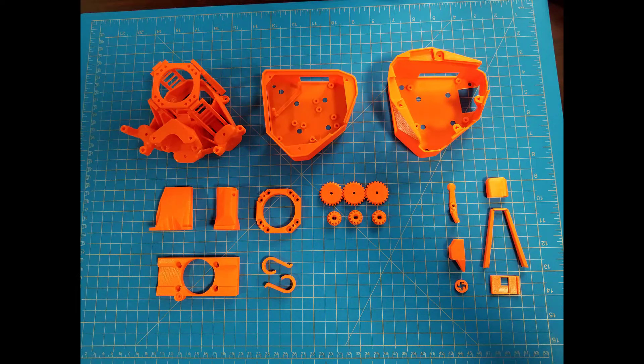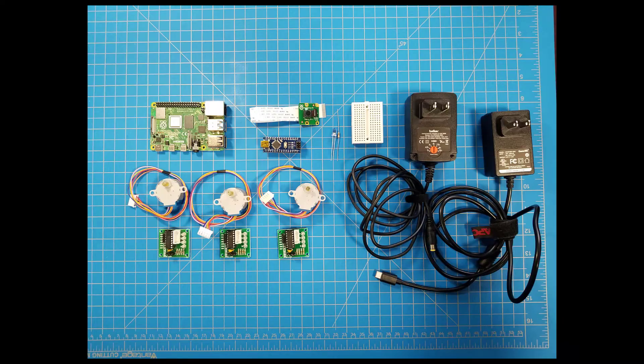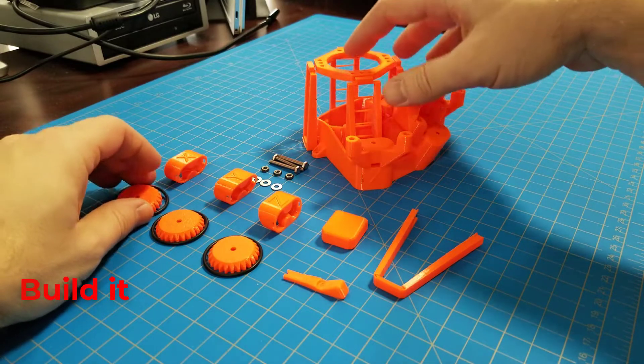And here are the parts. Selecting the objective lens was the scariest part for me as it's the single most expensive part and I don't know much about optics. And you'll need one of these tube length correction lenses. Here are the electronics we need: one Raspberry Pi 4, one Pi Camera V2, and we need some nuts and bolts and such — we gotta hold it together somehow. Be sure to see the video description for a list of parts. Now let's put it all together.